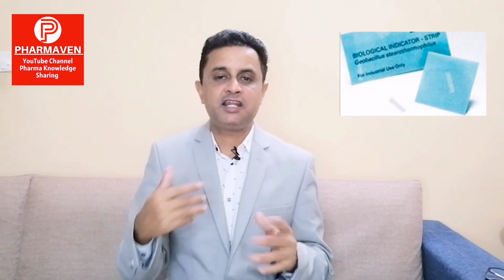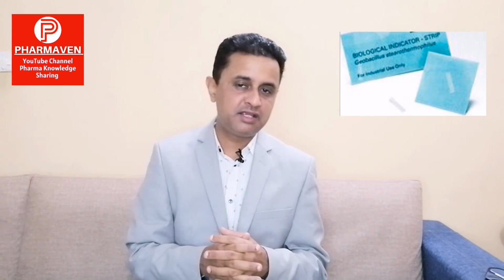This way it represents how exactly the BI has to be placed, and it will eliminate the false failure caused not by an actual steam penetration issue, but because the BI itself is acting as a hindrance or blockage for the steam flow.